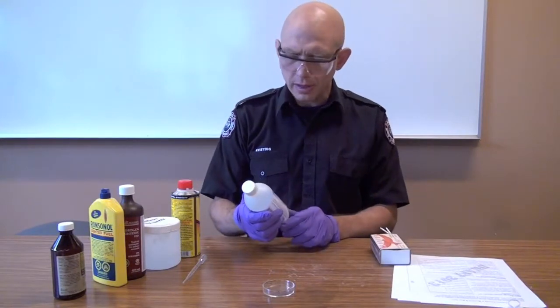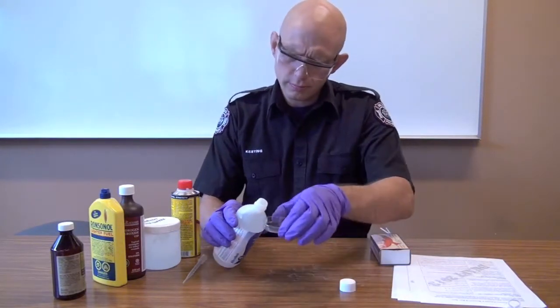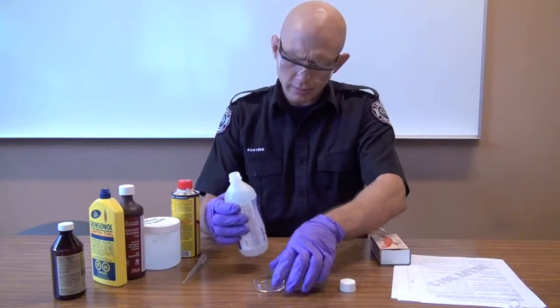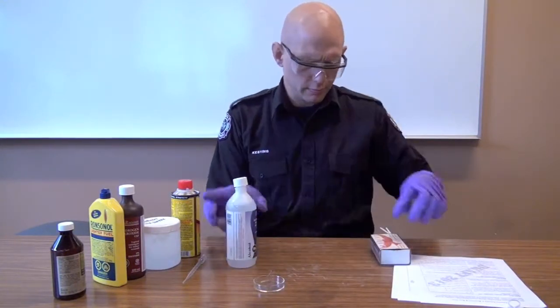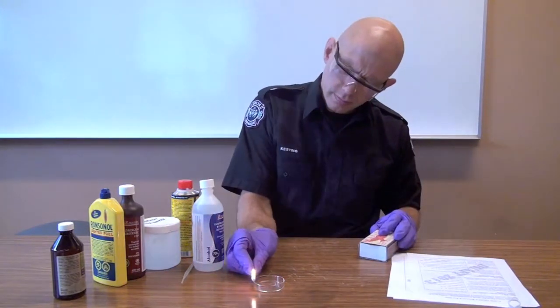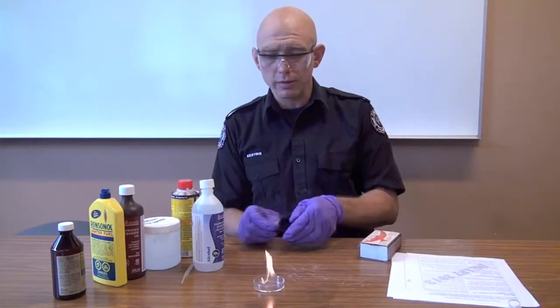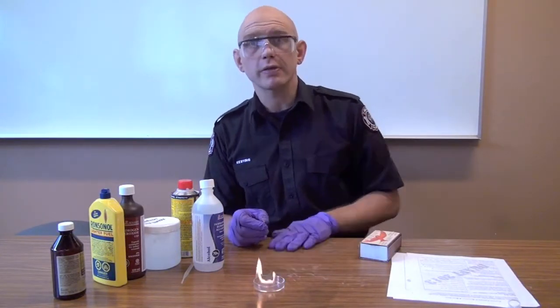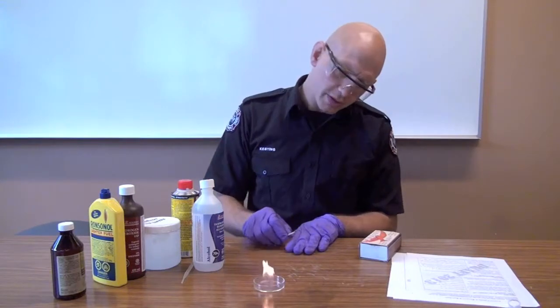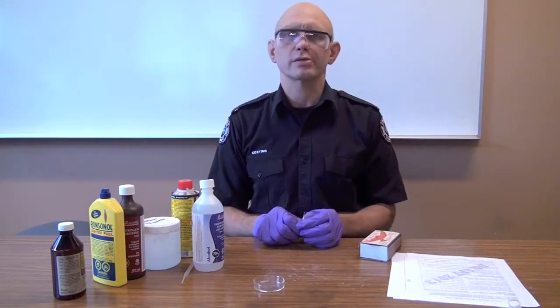Methanol burned — how about isopropyl rubbing alcohol at 70%? Rubbing alcohol burns as well. As you can see, the flames are a little bit more yellow than the methanol, but there's still a touch of blue — so it burns with a blue-yellow flame with hardly any smoke.